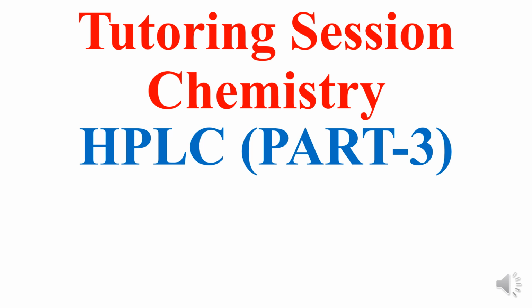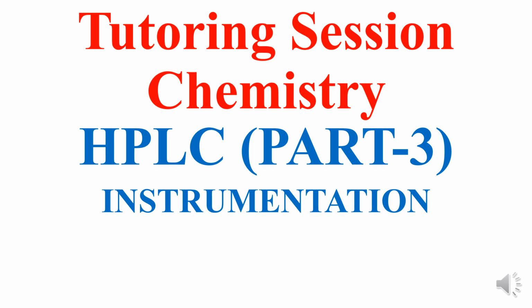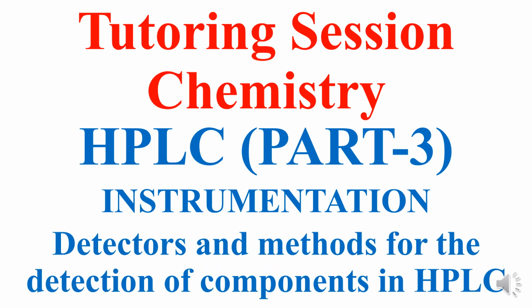The current video is part 3 of the 7-part series in HPLC. In this video, I'll explain the general features of instrumentation in an HPLC setup. And this will be followed by a detailed explanation about the detectors and methods that are commonly employed for the detection of components in HPLC.